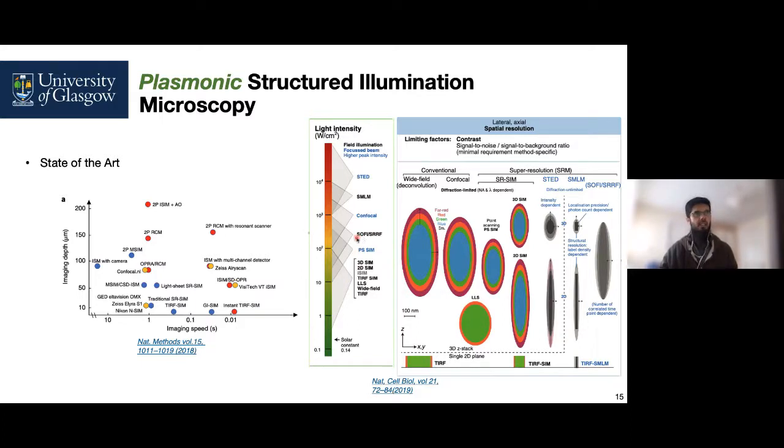So we see that the illumination intensities for structured illumination microscopy are much lower as compared to other microscopic techniques for having an enhanced resolution image.